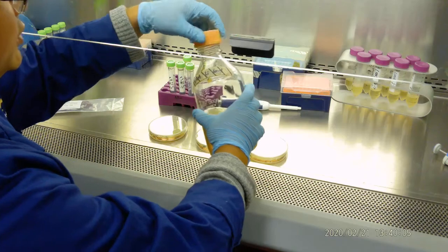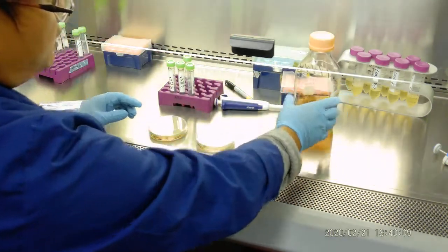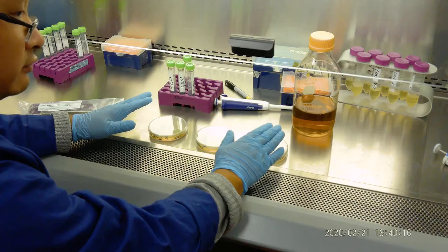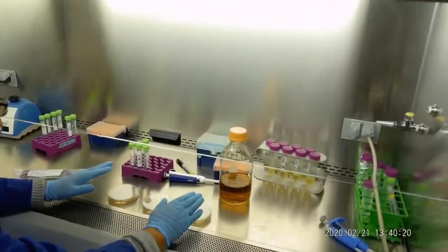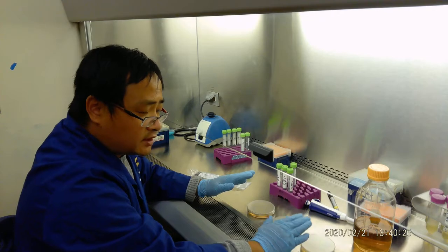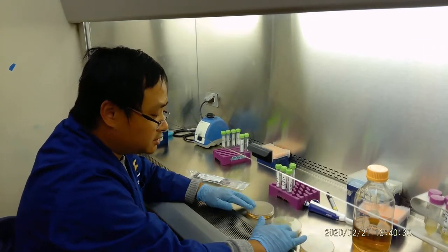Now what's the difference between pour plating and spread plating? You can see, in pour plating the media is melted agar. We pour it, and we don't have to prepare the media ahead of time. That actually saves 1 day of making the media. But for spread plating, when we're using agar plates, we have to prepare the agar plates ahead of time, let them solidify at least 24 hours, then we use them.